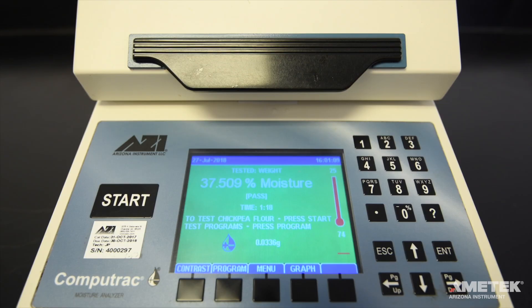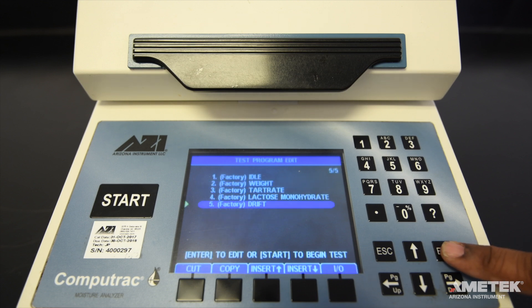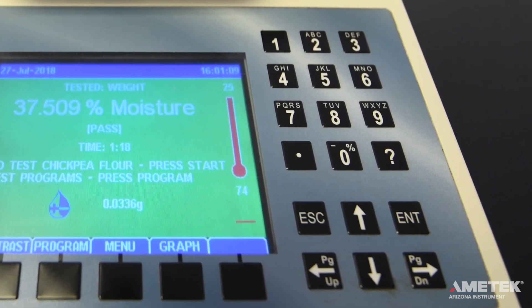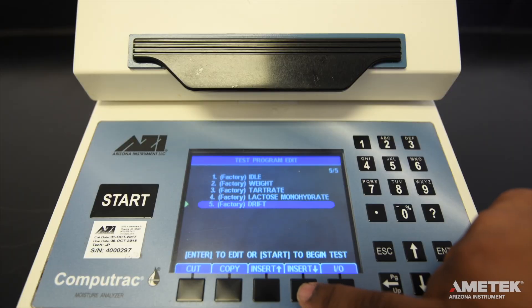To manually add a test program, press the menu button. The first item on the main menu is test programs. Press enter to enter the test program edit screen. Use the directional keypad to navigate through the program list. The up and down arrows will move the cursor one line at a time; the right and left arrows will move the cursor one page or ten lines at a time. Move the cursor over a current test program and click either the Insert Above or Insert Below button.